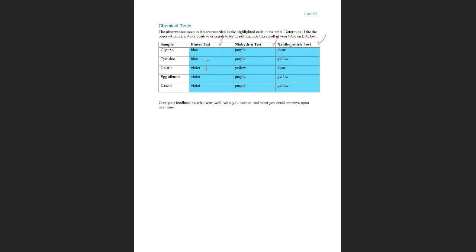The amino acids will produce a blue-violet color, let's say purple here. You need to have a primary amine or amino acid, and then ninhydrin will form the purple color, a chromophore, with a primary amine or an amino acid.